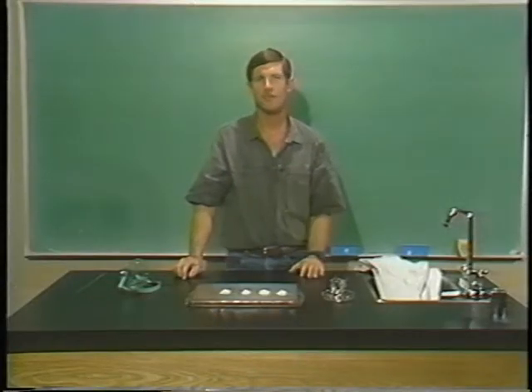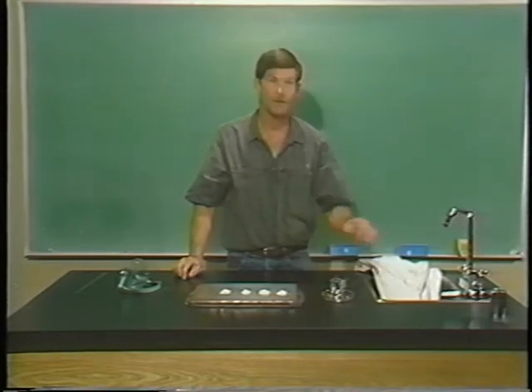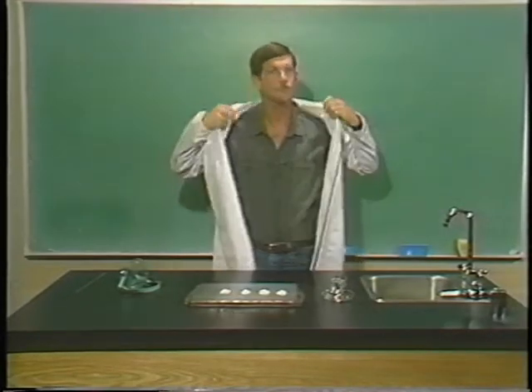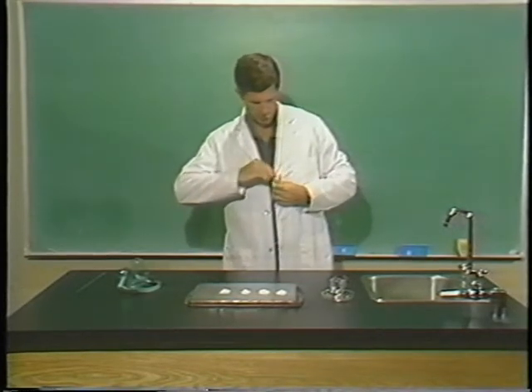But before we do this experiment, I've learned from experience, it's always good to protect your clothes. Lab coats work fine, and if you don't have a lab coat, you should wear some old clothes whenever you do science experiments, because sometimes you never know what's going to happen. I should move this microphone too. I'll put it here on the lab coat.